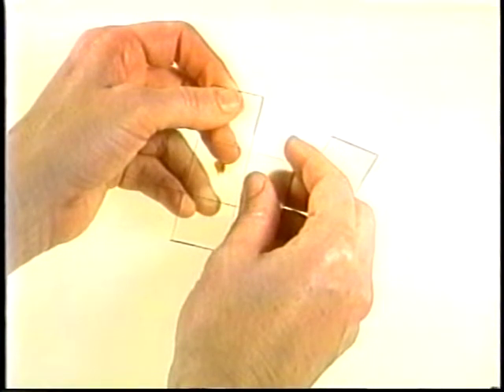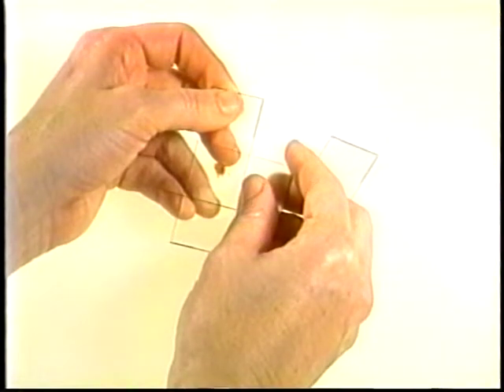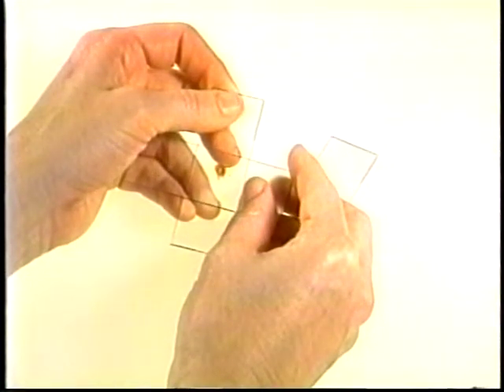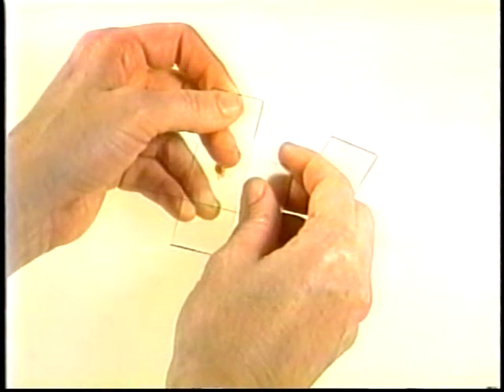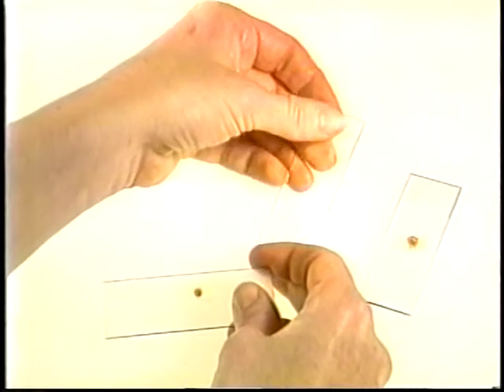If the material expelled onto one slide is ample enough for more than one smear, it can be easily divided. This is done by positioning 2 slides in the starting position for a basic smear. The top slide is rotated down far enough so that it touches the droplet, but does not spread it significantly. At this point, separate the slides. A portion of the droplet will have been transferred to the top slide.